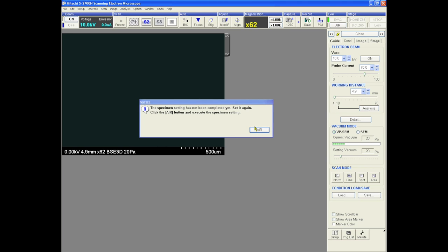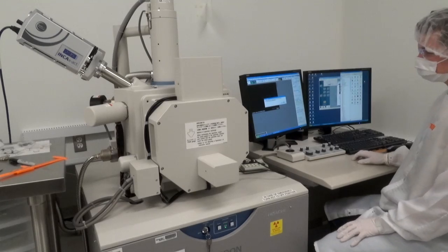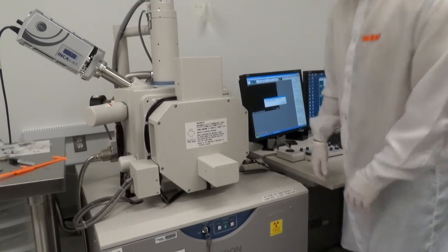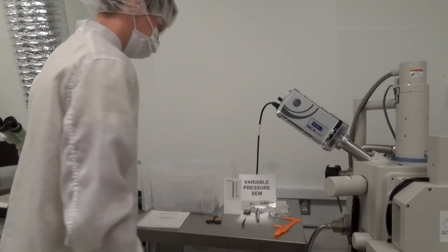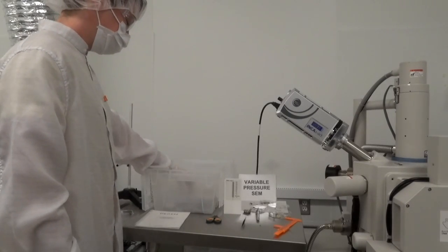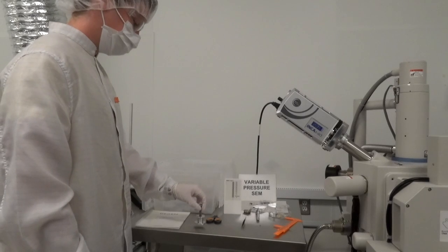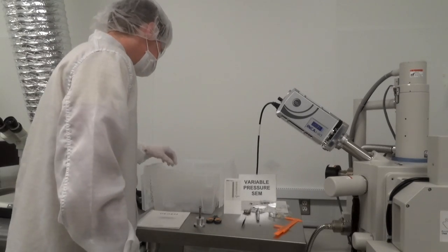While the chamber is venting, we will mount our sample onto the stage holder. A single stage holder is available at the SEM station for general public use. There are varying sizes of stages. Choose the stage that is closest in size to your sample and attach the stage to the top of the stage holder.